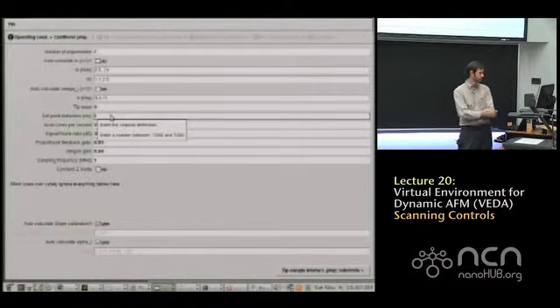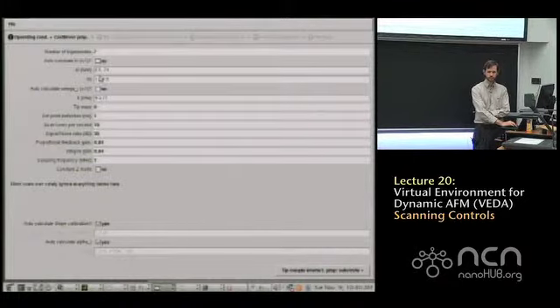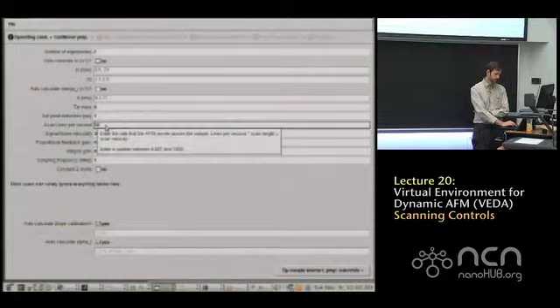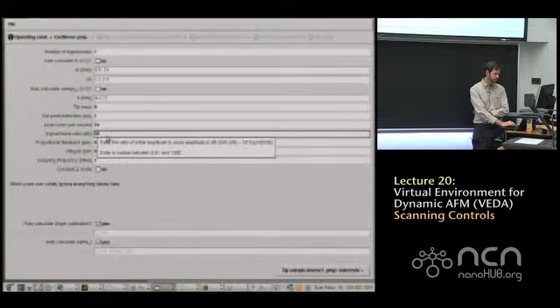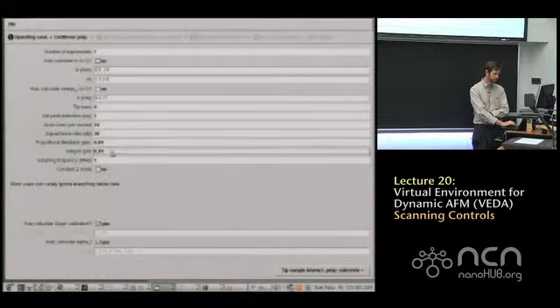Okay. Set point deflection in nanometers. You could convert that to force if you multiplied by your cantilever stiffness. Scan lines per second. Signal noise ratio. So we include the effect of some random noise, which you might have to deal with in your experiments. And then two gains, proportional and integral. We'll talk about those in a second. Sampling frequency. And then you can ignore everything below there.